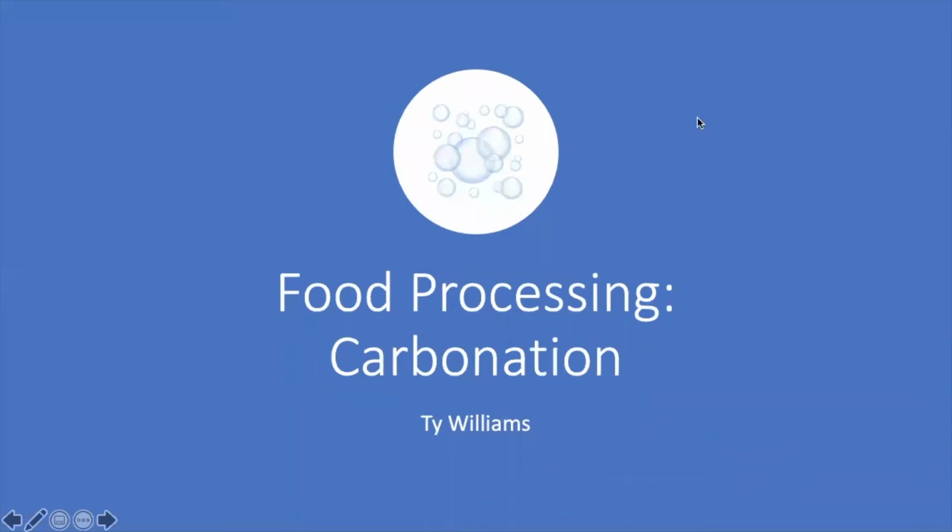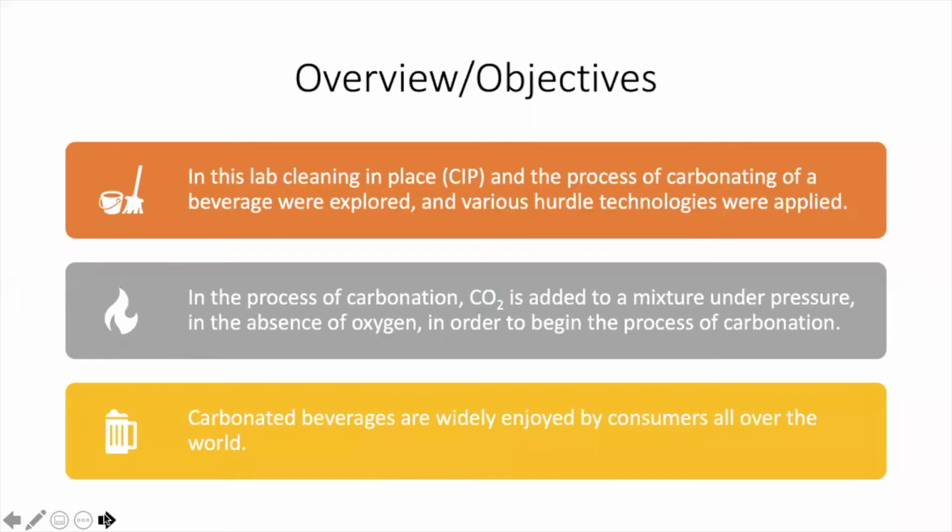Today we will be discussing the carbonation laboratory. In this lab, cleaning in place procedures, the process of carbonating a beverage, and various hurdle technologies were applied. Carbon dioxide is added to a mixture under pressure in the absence of oxygen to begin the process of carbonation. Carbonated beverages are widely enjoyed by consumers all over the world.